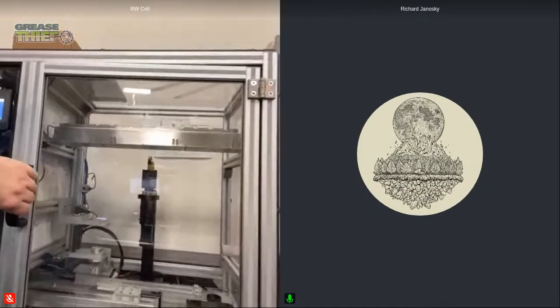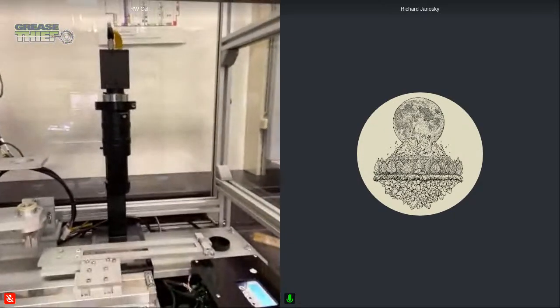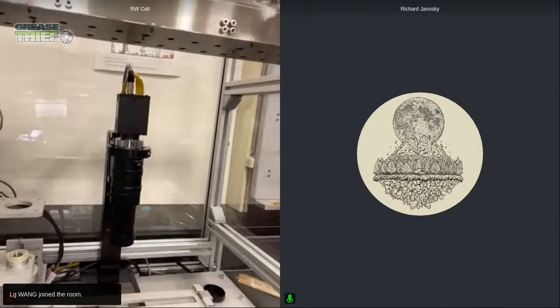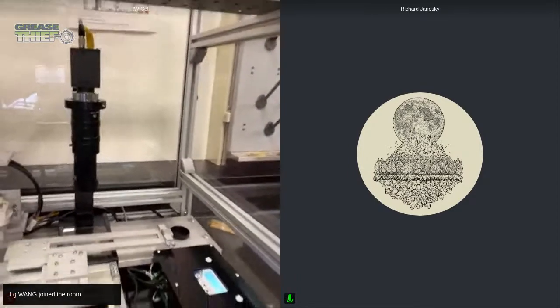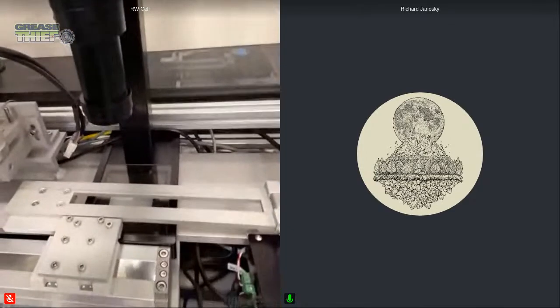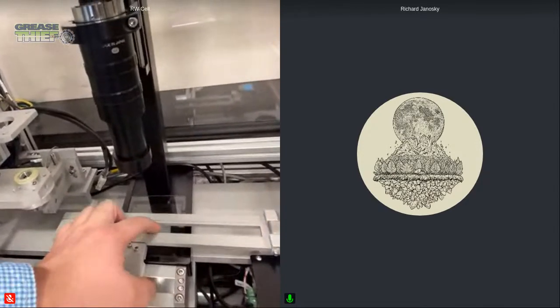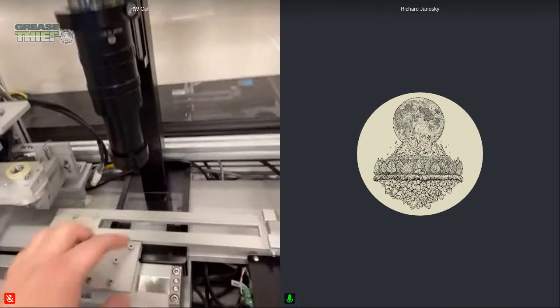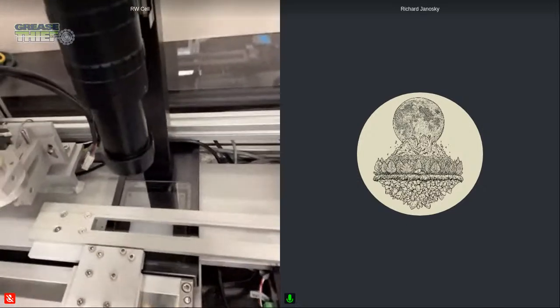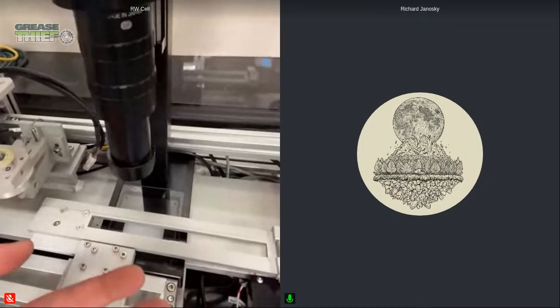The analyzer that's next to us here has the newest camera. This is the newest generation unit. So you notice that this camera is just a little bit bigger than the one that was in the other unit. And I just wanted to show off both units so that everybody got to see them both. And there we've got the LED controller next to it. So if you see here, there is the cutout in the table that I was mentioning earlier where the substrate sits. And this hole is completely through. And underneath here is an LED light. That little white panel in the middle there is an LED light. In a minute, I will turn it on and we'll show that flashing. So that's going to illuminate from the bottom.